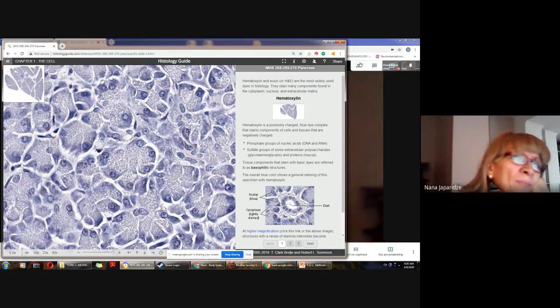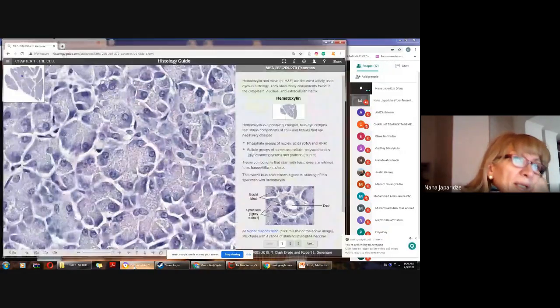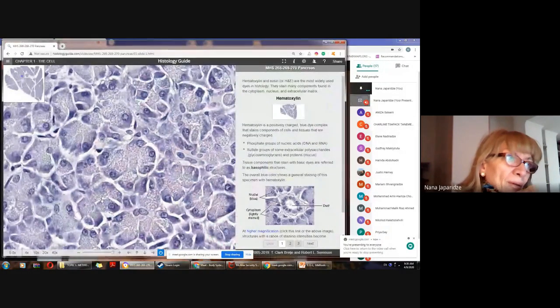So this is a really very small unit of length, but not the smallest, because we have also, for example, angstrom, which is used in transmission electron microscopy, and 1 nanometer is equal to 10 angstroms.